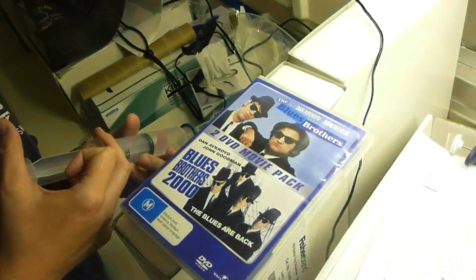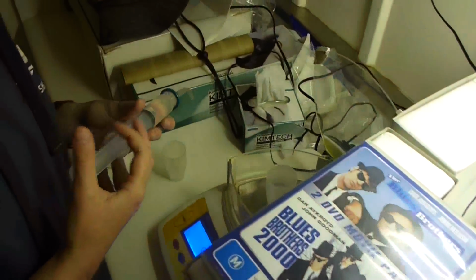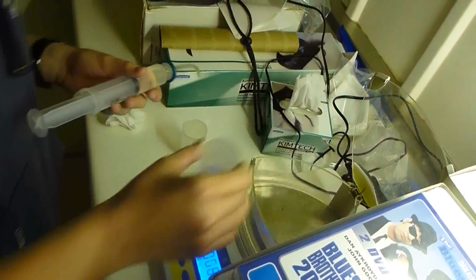So what are you doing, Emily? Weighing out samples. Why are you doing that? So that we know how much alkalinity is in it. 21.025. So it measures the total amount of alkalinity. So you need to get back to a concentration, you need to know how much sample you had.